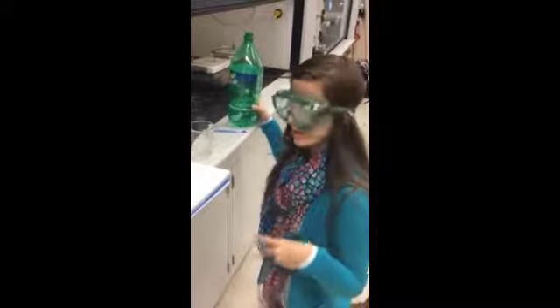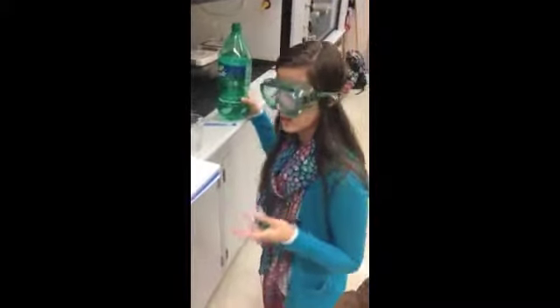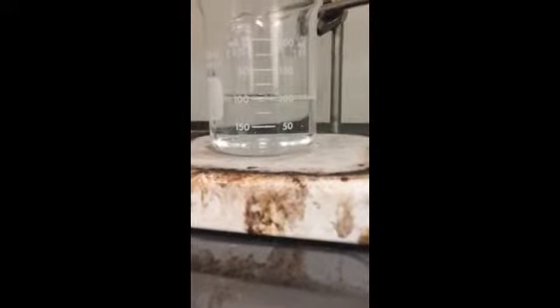The sodas provided were carbonated, so the bubbles that result from the carbonation are going to cause errors in our analysis. So to remove the bubbles, you have to pour about 100 milliliters of the soda into a beaker, and then you heat it for at least 15 minutes. Use the meniscus right at 100 milliliters.